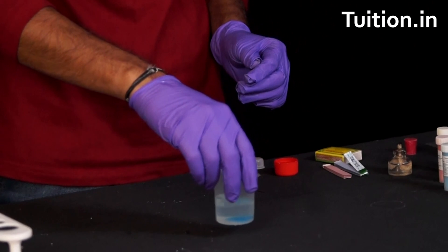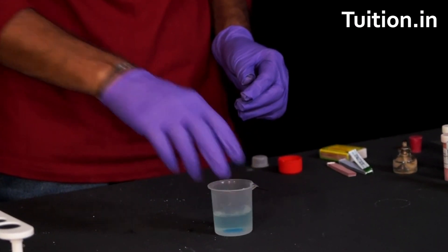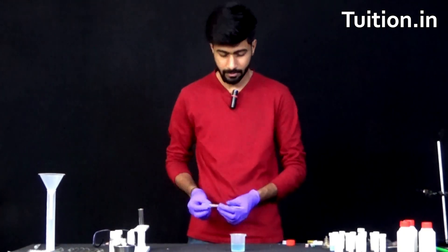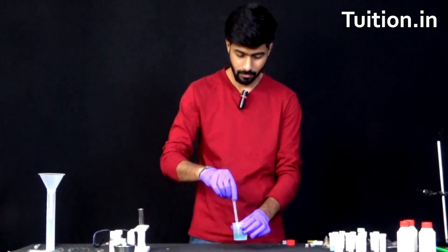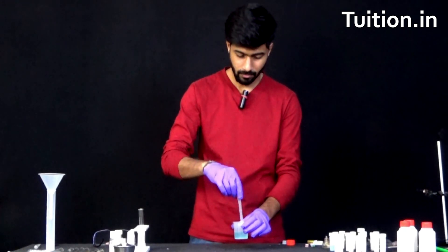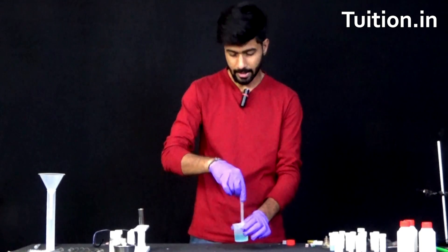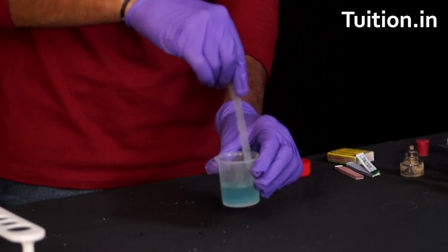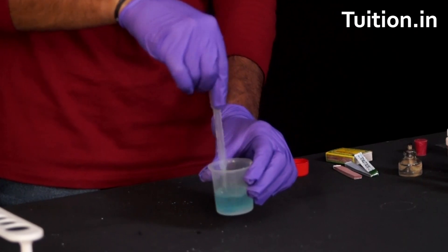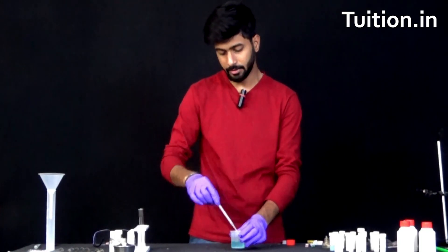Let me just stir it and here we have a blue copper sulphate solution with us. Let us put it back now.